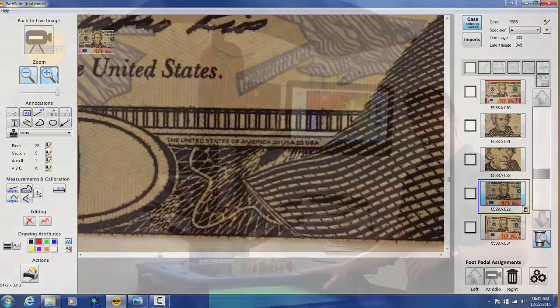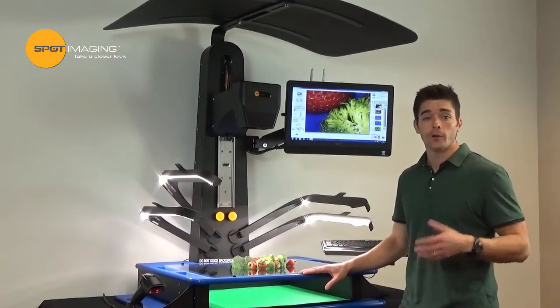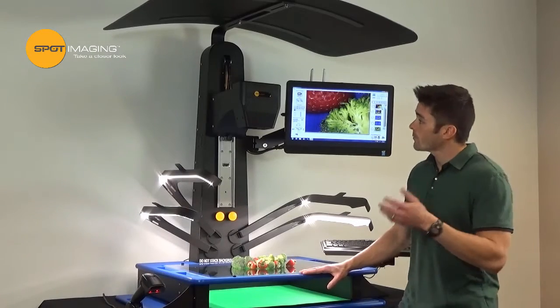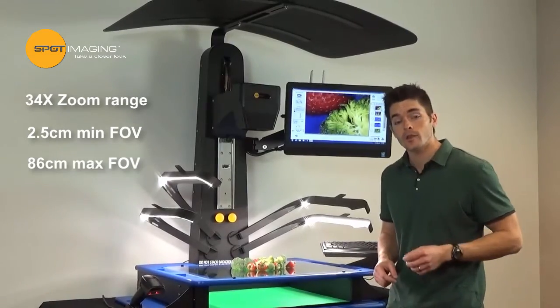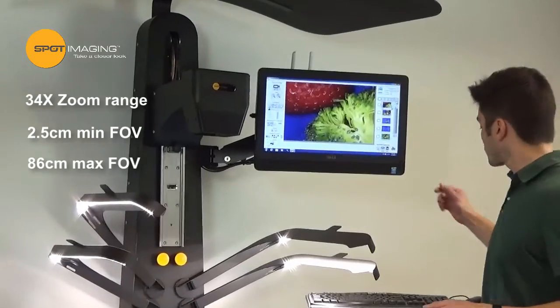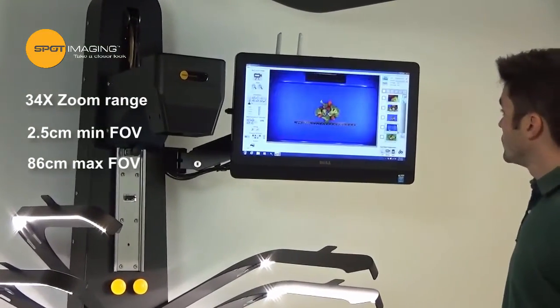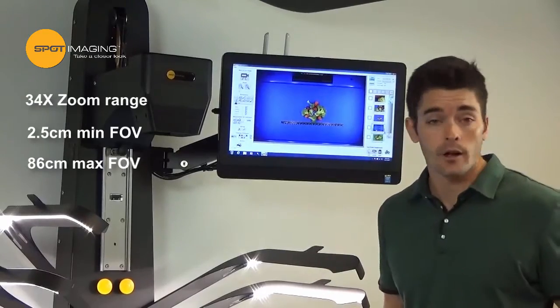Today we're going to be using fruits and vegetables in place of real tissue, just in case any of you guys are eating lunch watching this. The camera is equipped with a 34x zoom range, allowing you to zoom down to a small 2.5 centimeter field of view for specimen details and zoom out to a large 86 centimeter field of view for imaging, say, a diabetic leg for example.